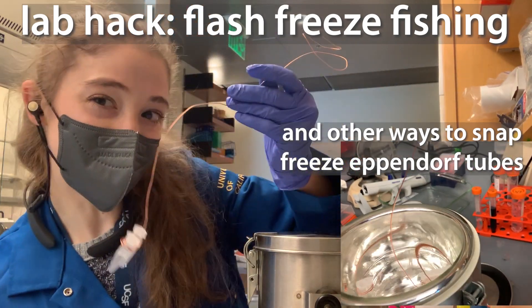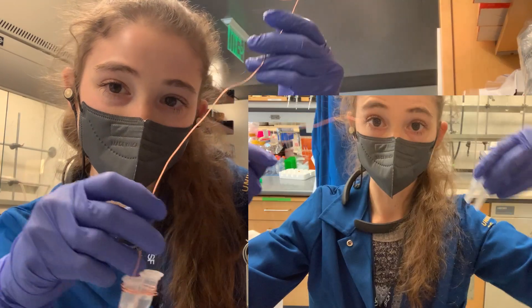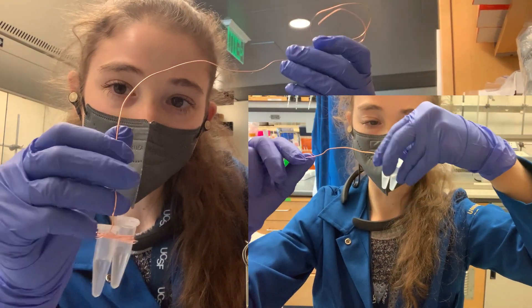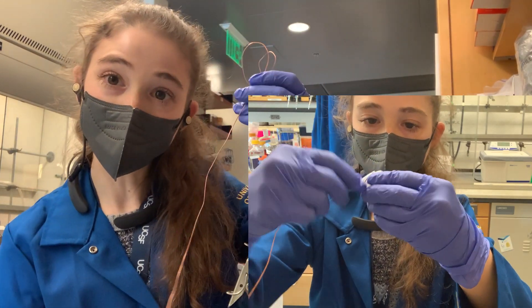Do you have a tube you need to flash freeze? No fish! Fish and liquid nitrogen. Today's lab hack is you can use a wire, wrap it around some tubes, and now you can use this when you need to flash freeze your samples.